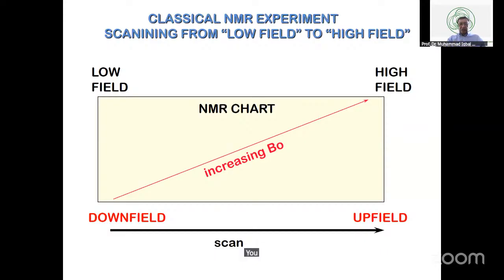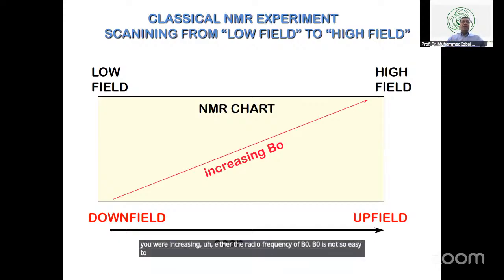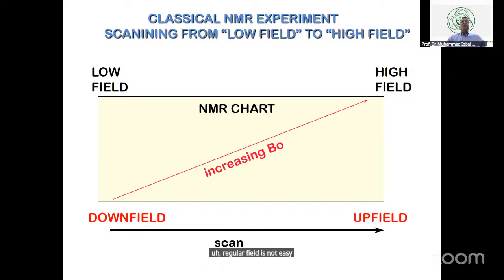You were increasing either the radio frequency or B naught. Magnetic field is not easy to sweep. Radio frequency was easier to sweep, so you get that.